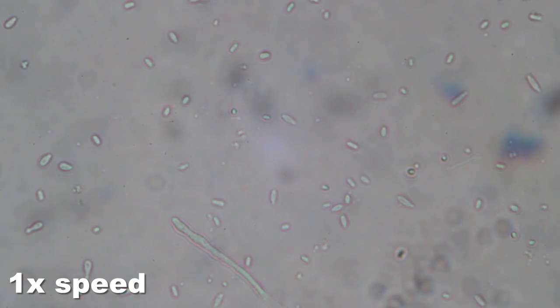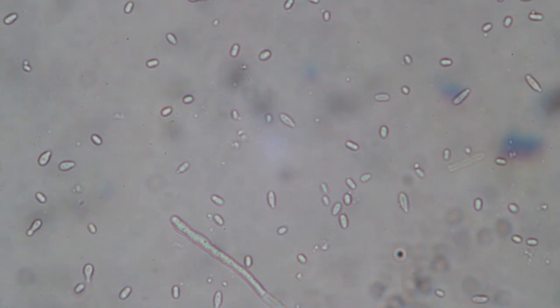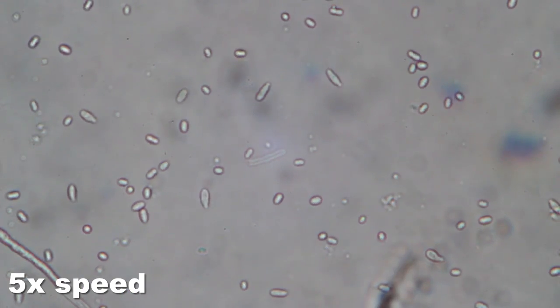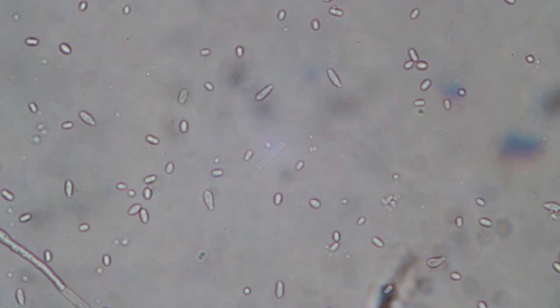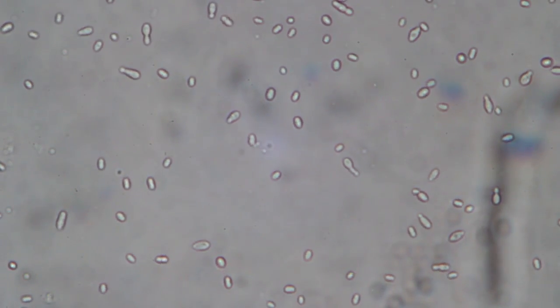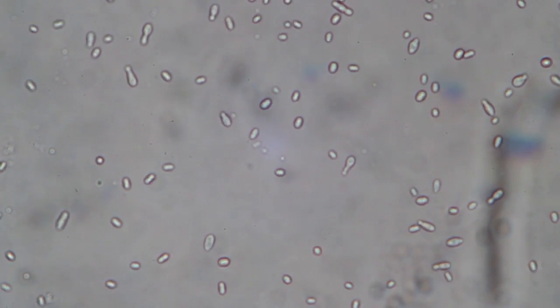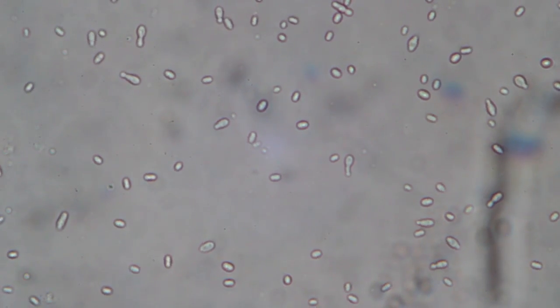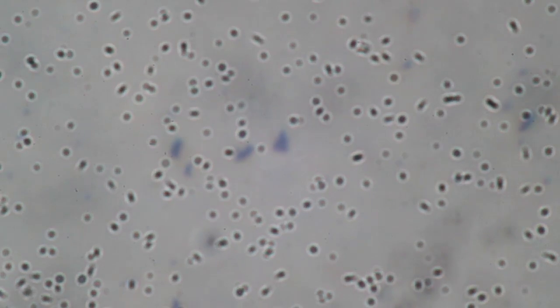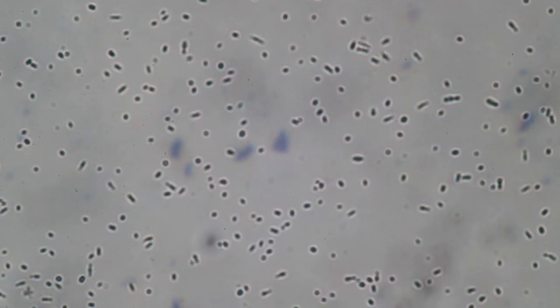Where there was no mycelium, I actually did find some spores and they were kind of moving back and forth. I think this could be because of Brownian motion, but I was not quite sure. I increased the speed a little bit — I was actually hoping to see them grow and elongate. Some of them look like they're growing a little bit, but I did not see any real change during this short time. I did find a lot of these little structures. I think they're spores. Initially I thought they could be maybe fragments of the mycelium, but they were actually much smaller than that, so I think they might be indeed spores.